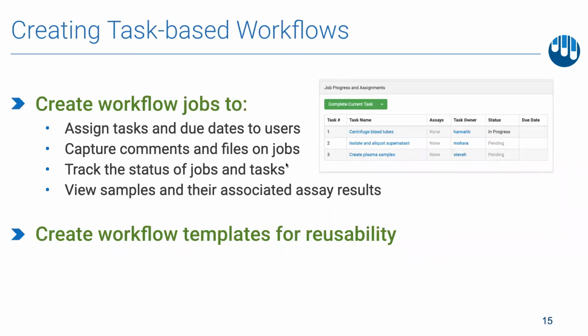In Sample Manager, a workflow job is comprised of a set of defined tasks that are associated with a set of samples. Team members can create workflow jobs and assign tasks and due dates to scientists, providing a sense of collaboration and accountability in the lab. Jobs will also capture comments and support file upload for further customization and information about what happened during the job.